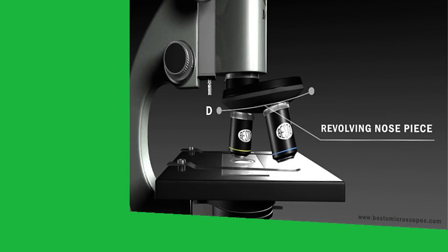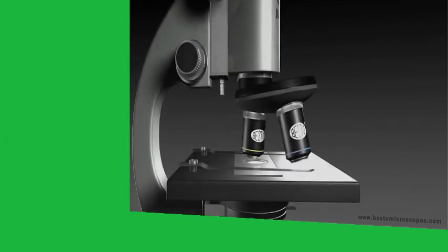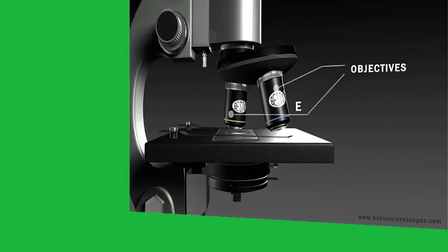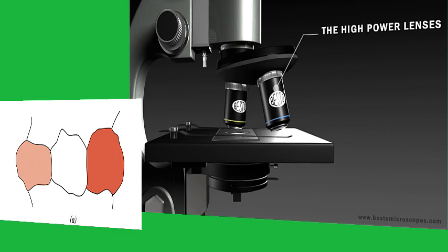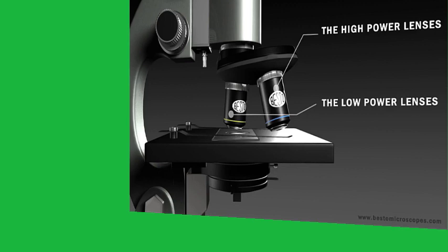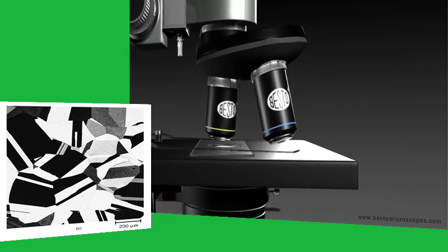The chemical reactivity of the grains of some single-phase materials depends on crystallographic orientation. Consequently, in a polycrystalline specimen, etching characteristics vary from grain to grain. Figure B shows how normally incident light is reflected by three etched surface grains, each having a different orientation. Figure A depicts the surface structure as it might appear when viewed with the microscope. The luster or texture of each grain depends on its reflectance properties. A photomicrograph of a polycrystalline specimen exhibiting these characteristics is shown in Figure C.